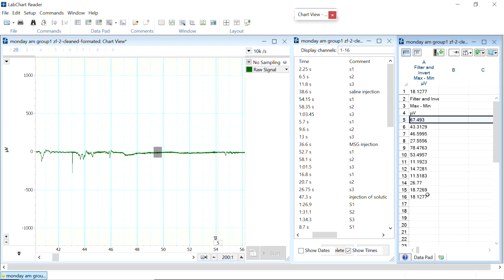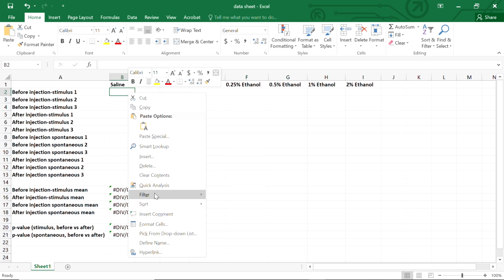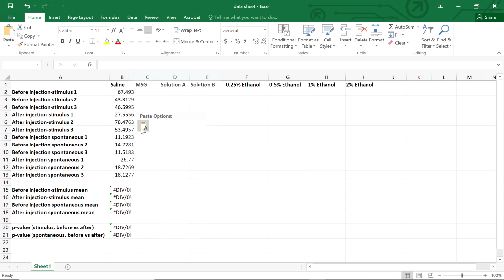Now I'm going to copy this into the Excel that I made. I shared this file in our Google Doc, so you can paste that. Okay, so what is in this data file? I have some calculations in here already for you, so we're going to talk about that later after we collect all the data.